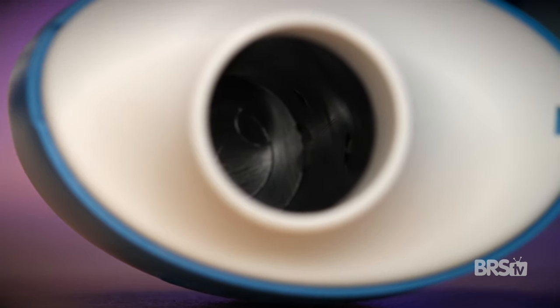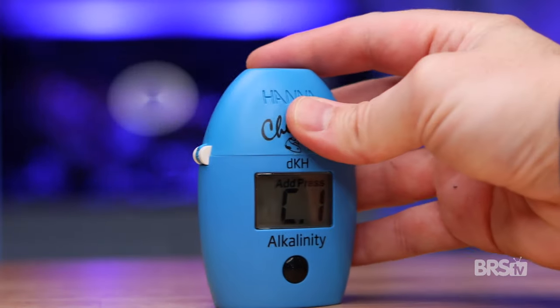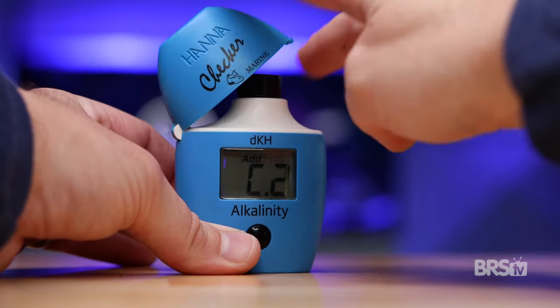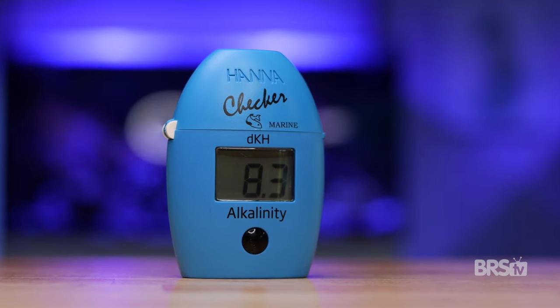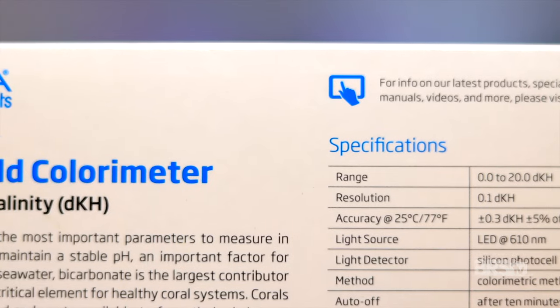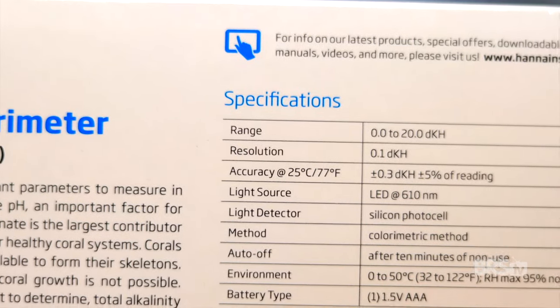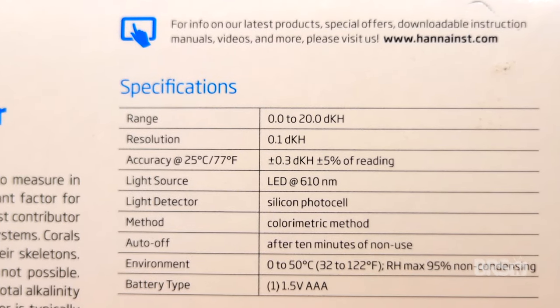All Hanna Colorimeters use a beam of light to give you a digital result. The light is passed through a cuvette with plain tank water to give you a baseline. And then after the reagent is added, the light passes through the cuvette again, reading the difference between the two and translating that difference into a digital DKH readout. The Hanna alkalinity checker can measure between zero and 20 DKH in your saltwater aquarium with an accuracy of plus or minus 0.3 DKH.